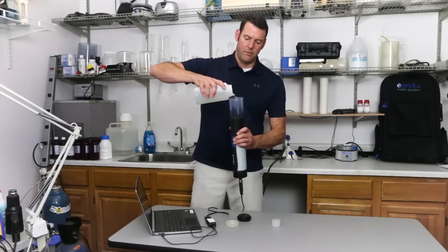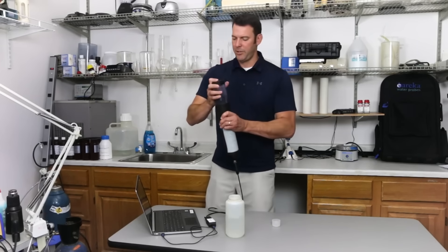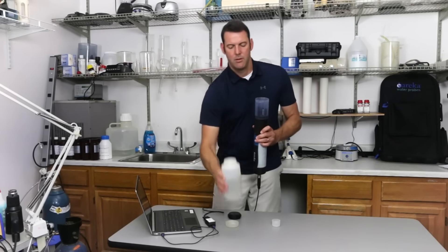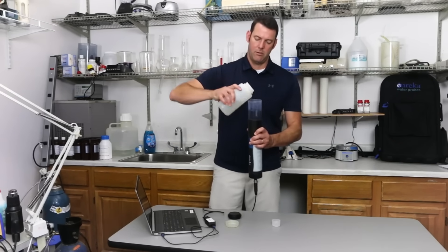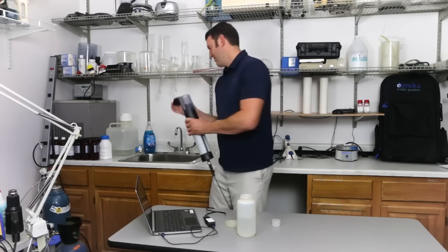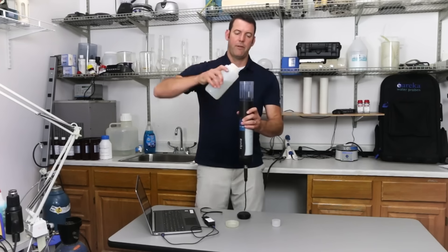First rinse — a little shake — pour that out. Second rinse. Now fill it up.